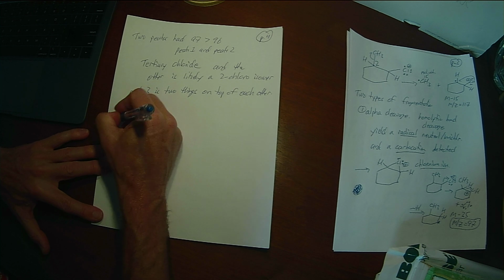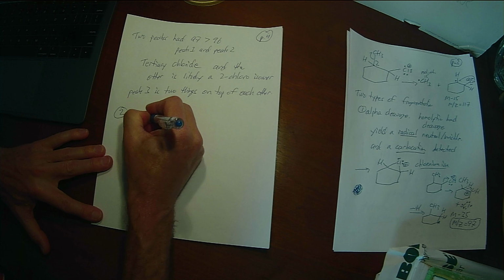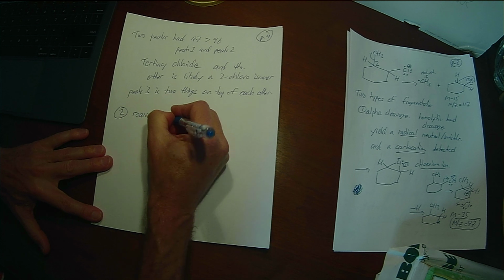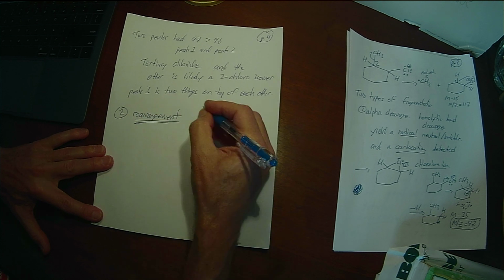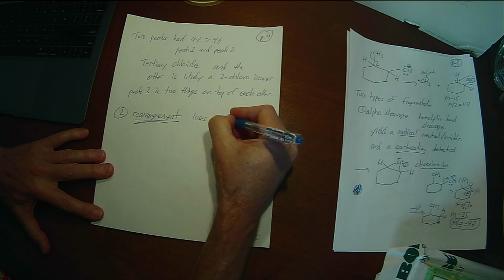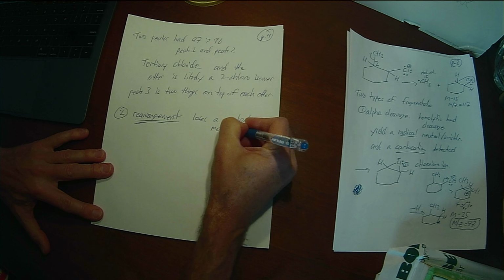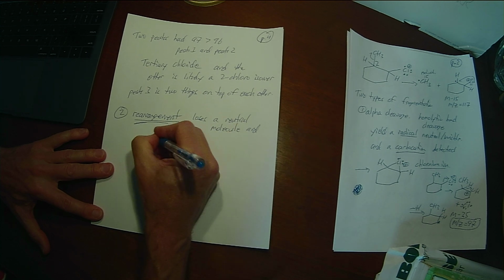So the second pathway for fragmentation is called a rearrangement. And it's distinct from an alpha cleavage in that it loses a neutral molecule and generates a new radical cation.